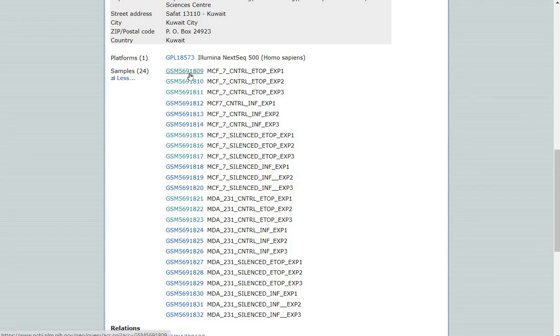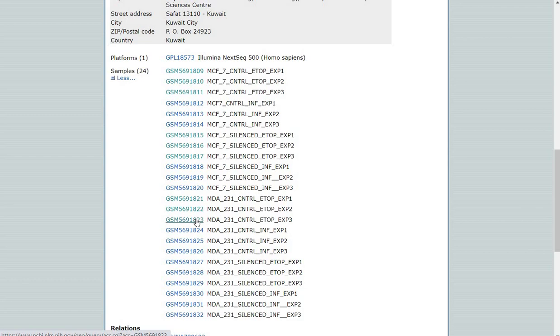For my analysis, I will be using the samples 9, 10, and 11, and also 21, 22, and 23. At the end of the analysis, I aim to identify master regulatory molecules which regulate gene expression in triple negative cells.